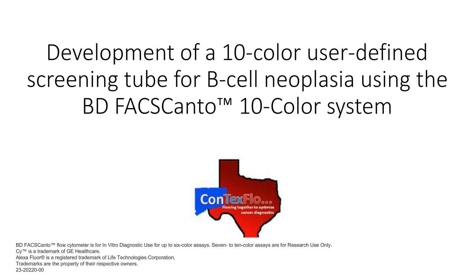The question is from Camille. Have you tried Kappa BV605 for intracellular staining? We have not. It's a great question, and I think we need to do it. But as of now, we've not tested it intracellularly.